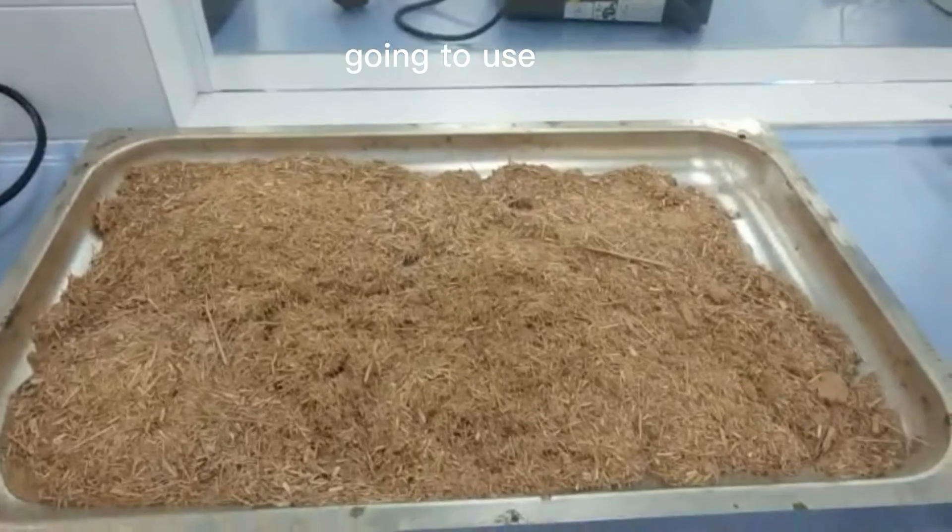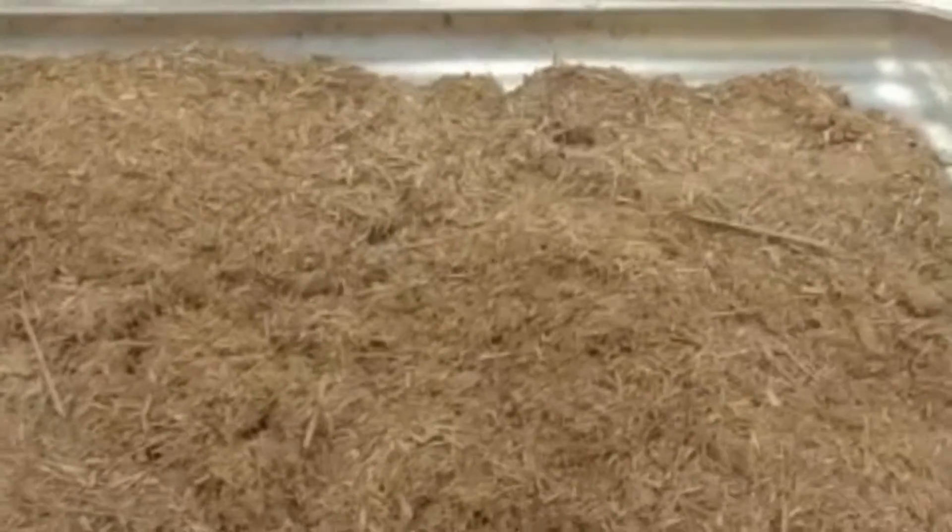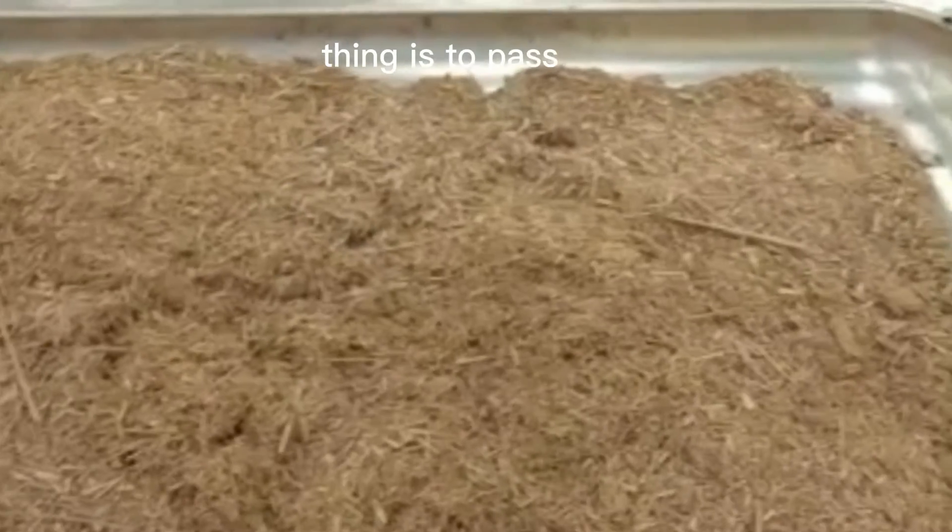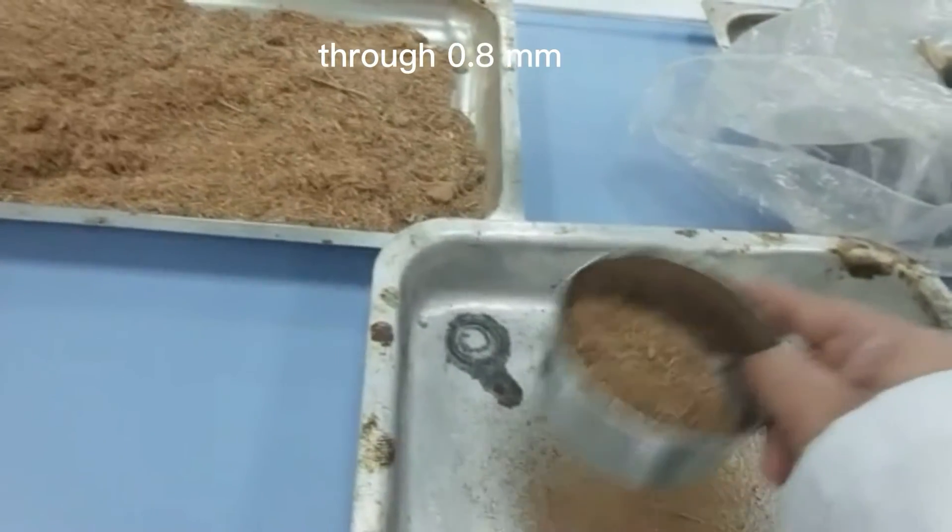The feedstock we are going to use for the production of magnetic biochar is date palm. So the first thing is to pass the date palm through 0.8mm mesh size.